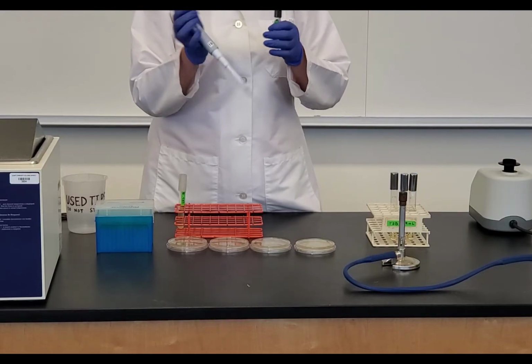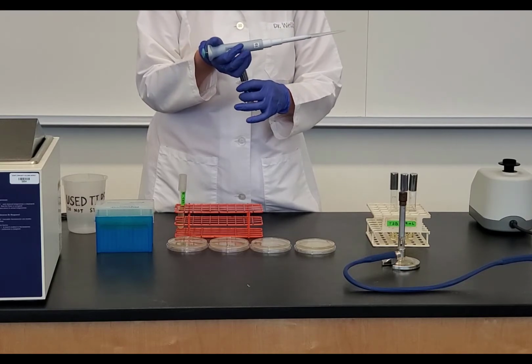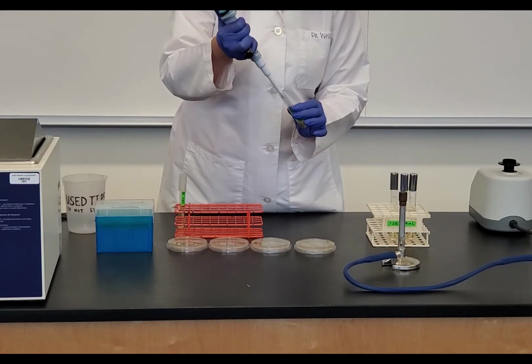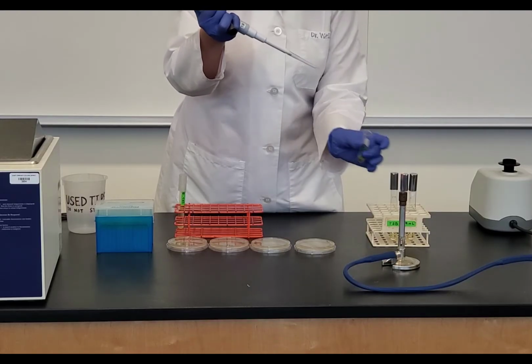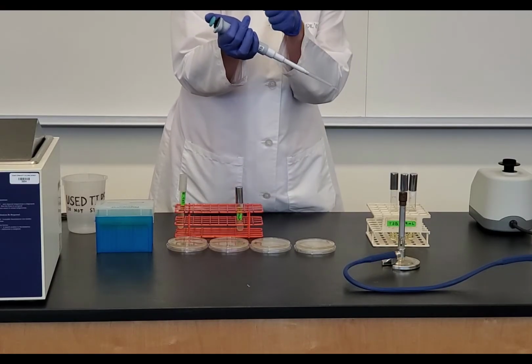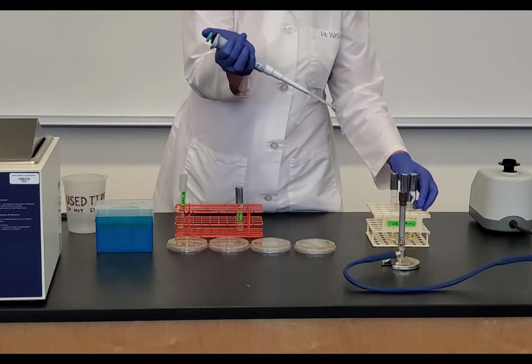So I vortex this. I'm going to take the cap between my pinky and ring finger, and anytime I go into a tube, I need to flame the opening. Push to the first stop, put my tip in, release the plunger, come out, flame it, cap it. Now notice how I go under my pipette and not over it. I don't want to go over my pipette because that could contaminate my sample.